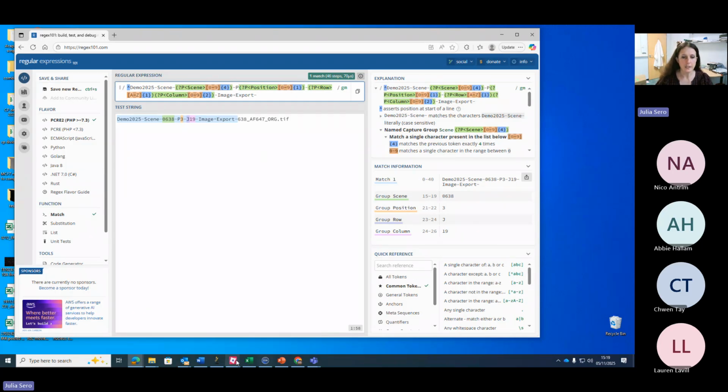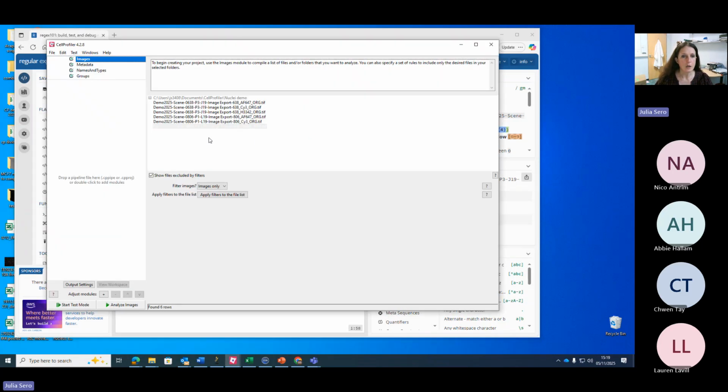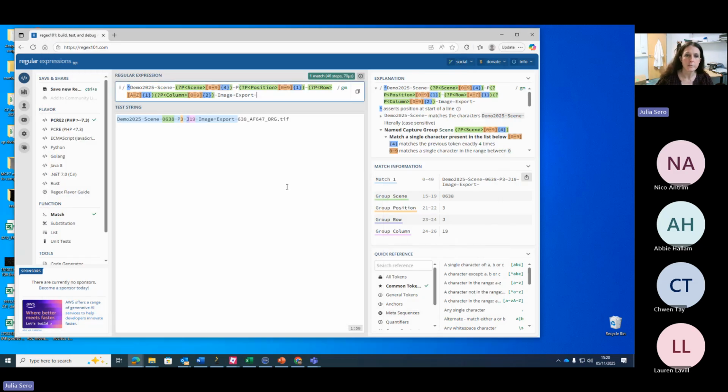It's a little bit complicated here. In both of the image sets here that we have examples of, there are 3 digits. But I know from looking at the original files that it goes 01, 02, 03, blah, blah, blah, 10, 11, 12, 99, 100. So we can either have in this little bit, we can either have 2 numerals, 3 numerals, or 4. Actually, no, yeah, there might even be 4 numerals.